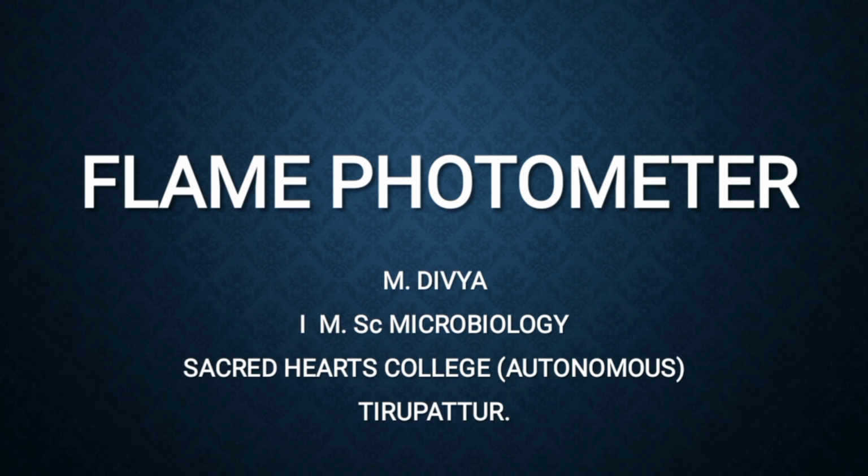This present video is about the flame photometer. We will see in this video who discovered this flame photometer, how it works, where this instrument is used, and what the advantages and disadvantages of this flame photometer are. Now we will see the introduction. Now, the flame photometer.